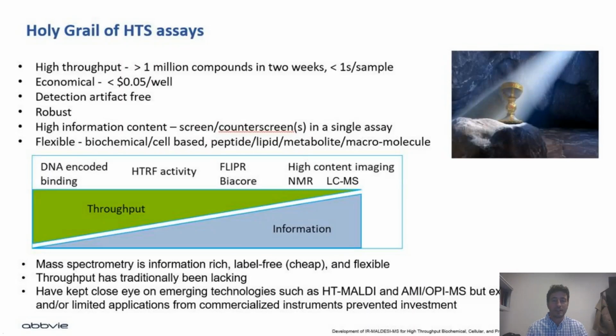Recently, in the last 5 years or so, there have been some new technologies based on mass spec that have come out, such as high-throughput MALDI, the Bruker Pharmapulse, or the echo-based technologies where they use an echo to introduce the sample into the mass spec, so acoustic mist or open port technologies commercialized by SCIEX. So those are also worth looking into, and I'd encourage you to look into those technologies as well on your own time.